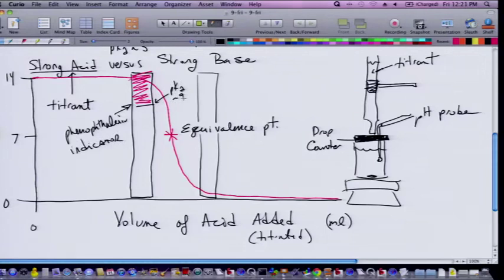Now, you might say that endpoint would be premature to the midpoint, the titration equivalence point here. And that would be if you were really looking at the middle of that range of fuchsia colors that would be produced as you went from the darkest fuchsia down to the lightest. And really what you want to do is imagine making your endpoint here, where the faintest amount of dye is detectable by eye.